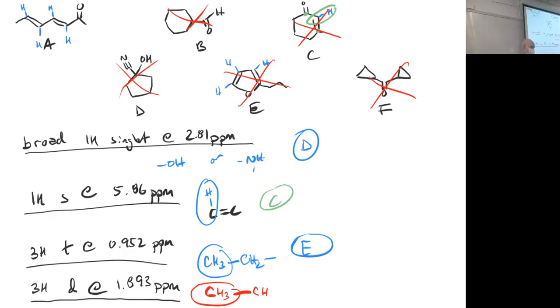We're looking at maybe 0.1 or 0.2 outside of our expected region, but it is possible that it'll be a little higher or lower than we've laid out for those ranges. So be firm on integral and splitting, and a little bit flexible with your ppm, knowing that it's not outright lying to you, but sometimes it's a little bit outside of your expected returns.